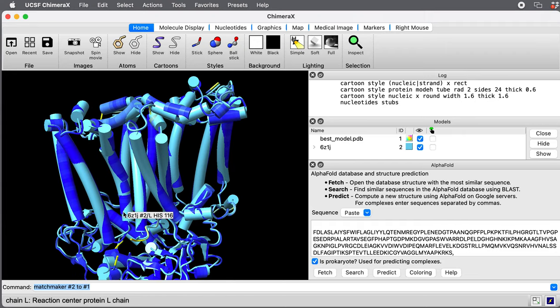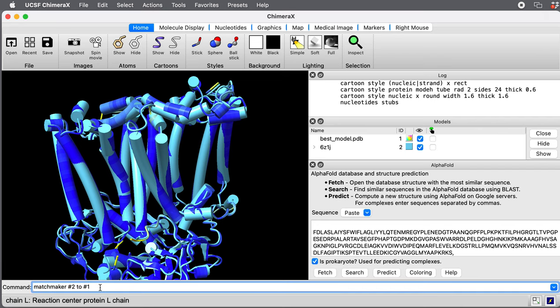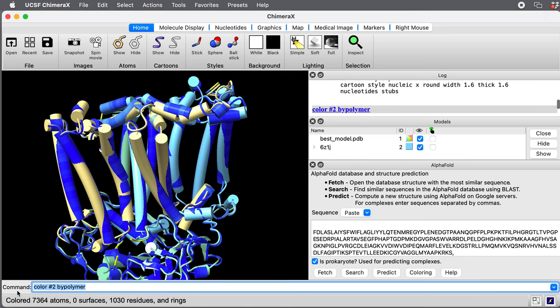Let me show you the three proteins in different colors. I can say color the experimental structure number two by polymer. That means color each polymer, each of the proteins, a separate color.